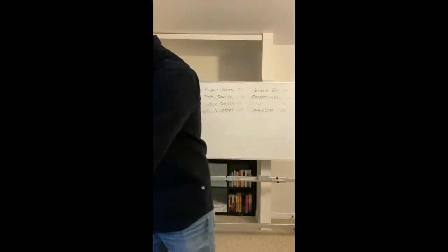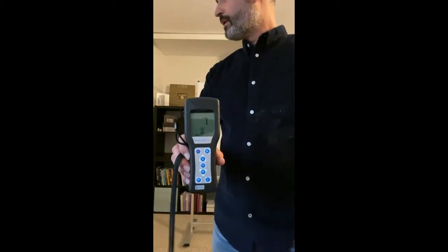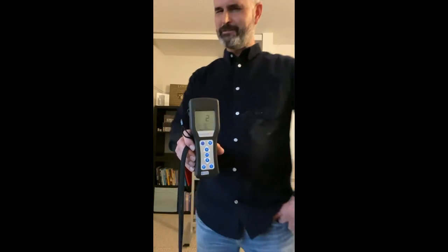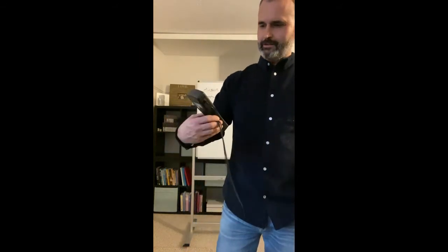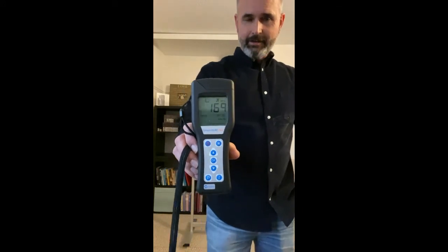And we shall see. So before any cleaning, any sanitizing, any disinfecting, we'll see what we get here. So the countdown is on. And I'm definitely expecting in the 400 or 500s on this guy. Oh, wow. Okay. Not bad. 169. So we have our starting point essentially.